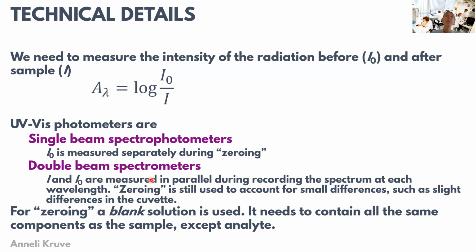Now, when we actually do the measurements, we have the light that goes through the sample, and we actually start getting the absorption measurements.